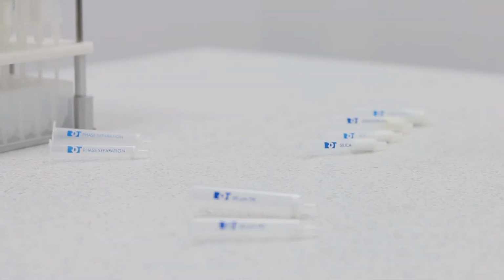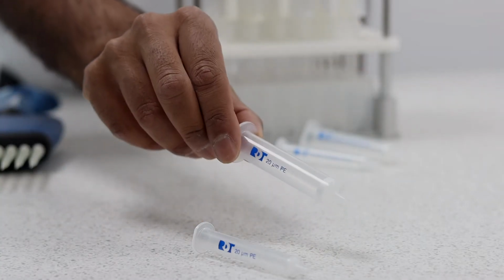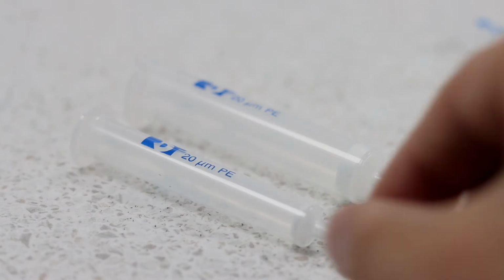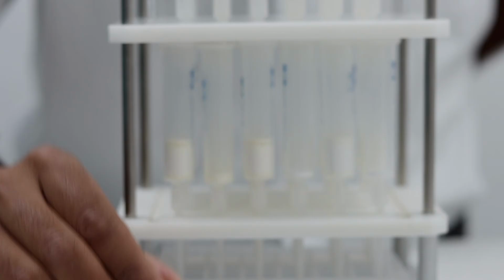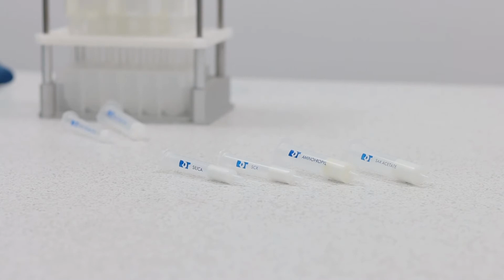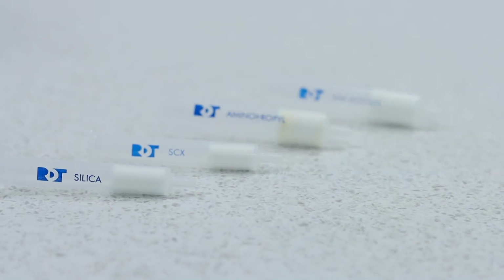For the different types of purification, we have different columns. For filtration, e.g. of a resin or other solids, use a 20 micron PE filtration column. Phase separation or liquid-liquid extraction, use a phase separation column. Use a solvent phase which is denser than water and which will pass through the hydrophobic frit, leaving the lighter aqueous phase retained by the frit. For solid phase extraction, use SPE columns.